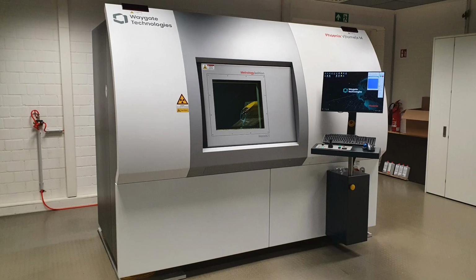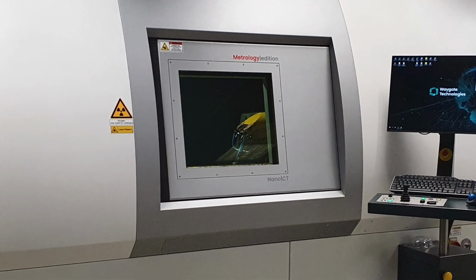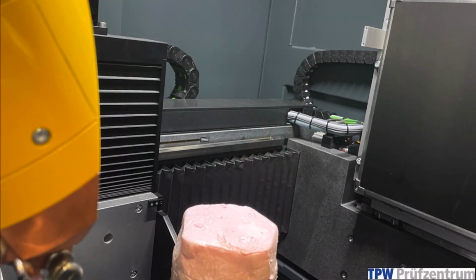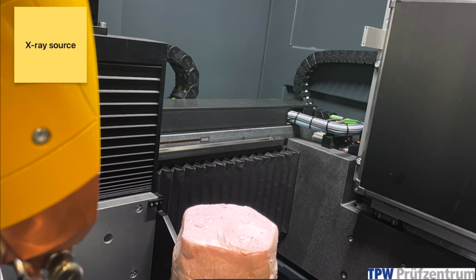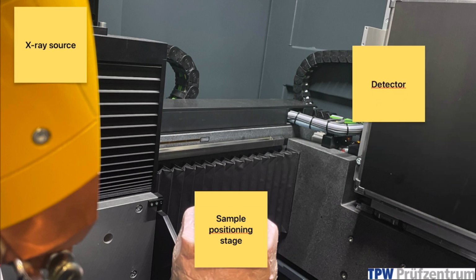This is what an industrial CT looks like. Let's have a closer look. So if you look into a CT, there are three components. There's an X-ray source, there's a sample positioning stage, and there is a detector.